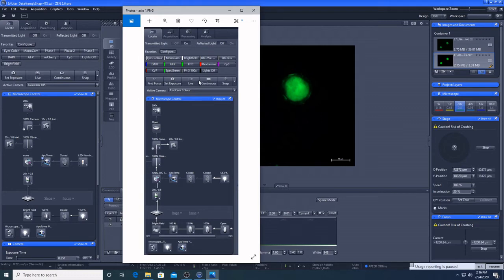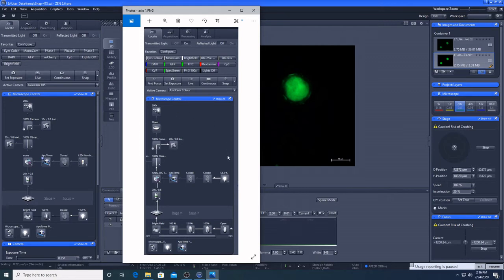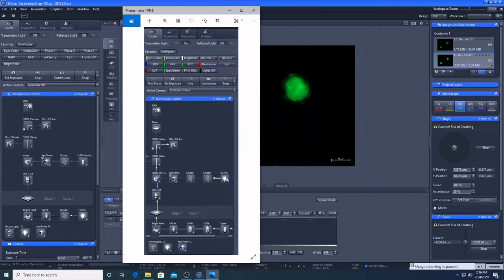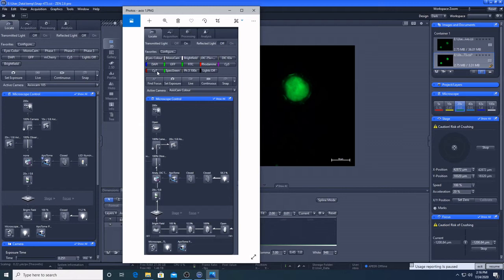So if you're doing your bright field imaging, then the Axio 01 would probably be the one for you. For fluorescence imaging, the Axio 02 has got these LED light sources, whereas the Axio 01 has just got a white light source. And then there are different filter cubes. So the reason that the Axio 01 has got this white light is so that it can work in conjunction with Cy7, which has a far red, and Axio 01 is actually the only microscope we have that can do Cy7, even with confocal, so they don't have that option.